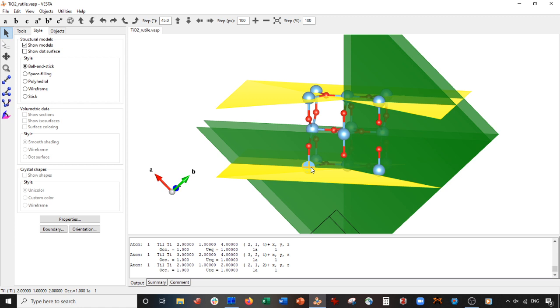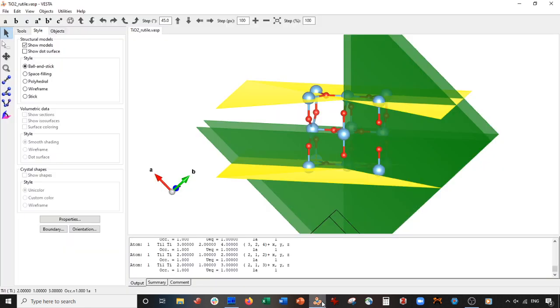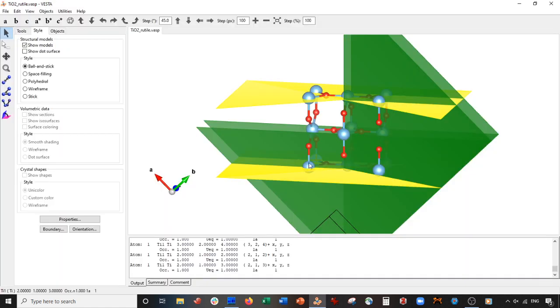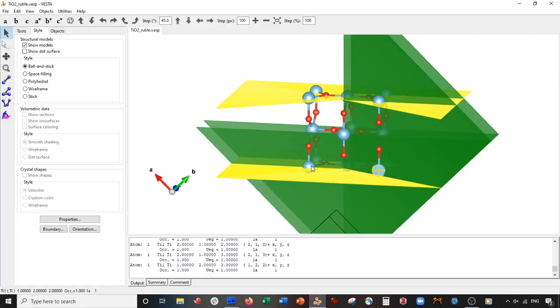Now go back to VESTA and define my new a vector in the new unit cell from this atom to this atom — double-click this atom. It shows up as 2, 1, 3. Go back to the text file: 2, 1, 3. Go back to VESTA and do the new b vector — it's going to be 1, 2, 2. Go back to VESTA and do the c vector: 3, 2, 2.